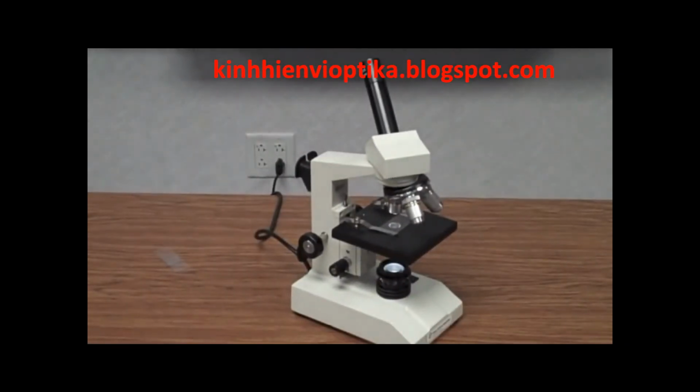Here is my microscope. This is a compound light microscope. This particular microscope will magnify images at 3 different levels. It uses light, and it also uses multiple lenses to magnify the image so that you can see it. What we're going to do first is talk about the parts of the microscope, and then we'll talk about how to use the microscope correctly.